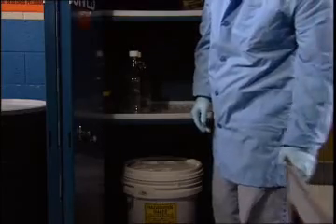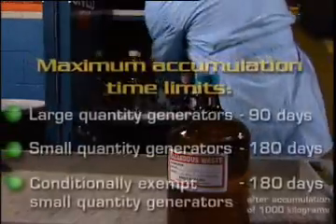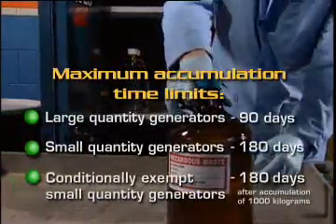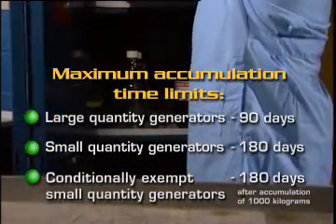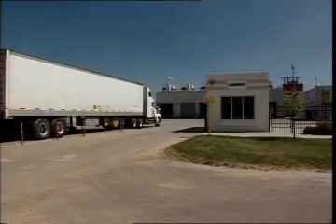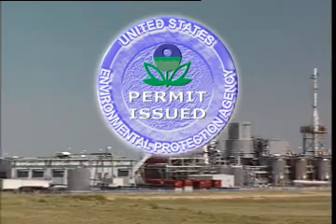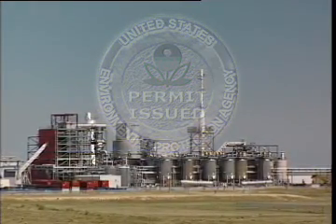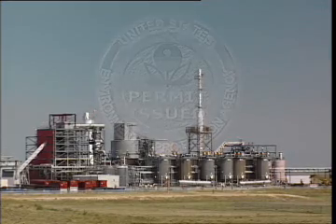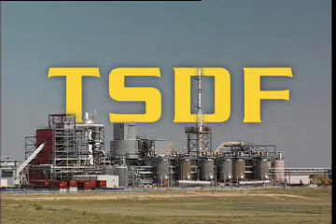The length of time that wastes may remain in the central accumulation area depends on the total amount of waste that your entire operation generates. Ultimately, your hazardous laboratory waste may only be shipped to a facility that has been permitted by the state or EPA to treat, recycle, store, or dispose of your type of waste. These facilities are often referred to as TSDFs.